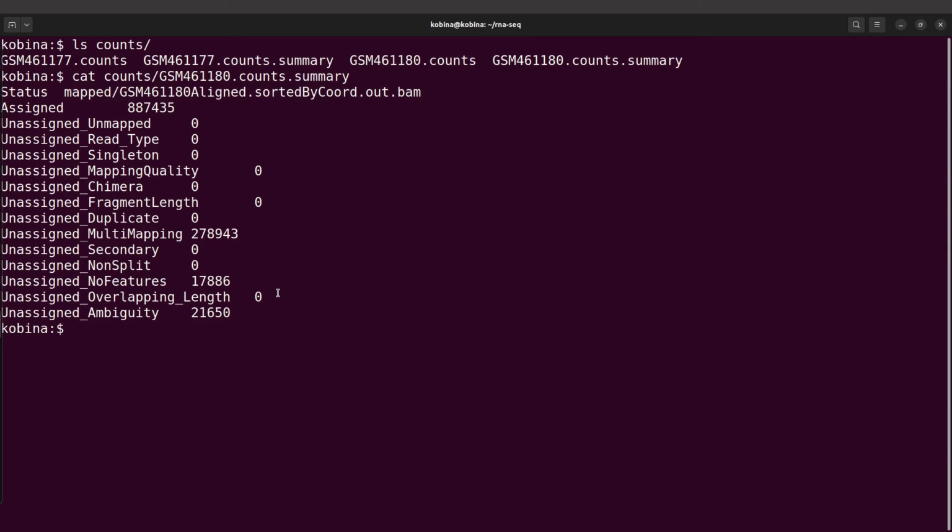Let's get back to our data. What we are going to do is to aggregate these two reports together, the report for the two samples, using MultiQC. To aggregate reports, let's say you have your FeatureCounts reports in a directory. So this is my directory, and I have my FeatureCounts reports. I have this, and then this. These are the summary files, the ones that FeatureCounts will use. So let's just say I want to aggregate using MultiQC.